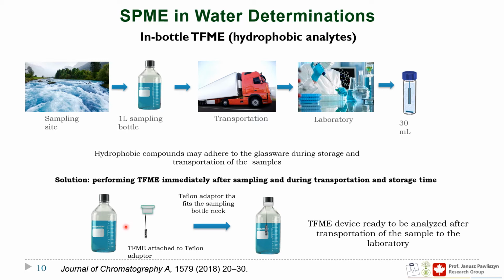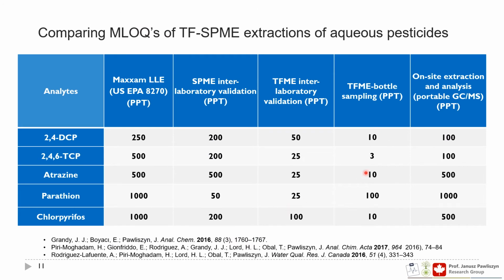But what you can do here is to place the insert in the cap of the bottle and hang the thin film in the bottle. So as soon as you sample the water, you immediately start performing extraction to avoid losses. And look how the results look like.